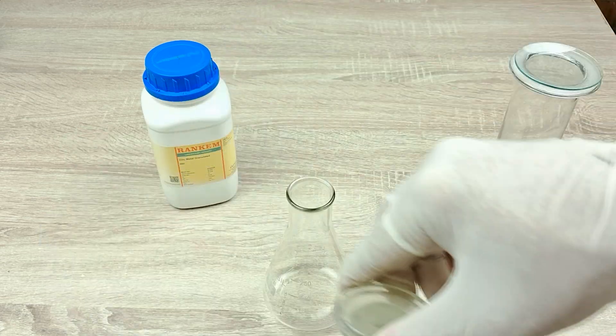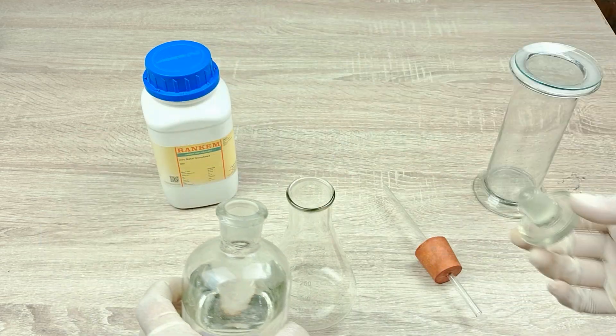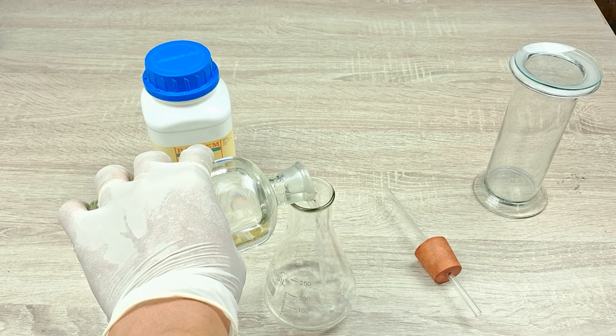Introduce about 50 to 100 ml of dilute hydrochloric acid or dilute sulfuric acid into the flask.